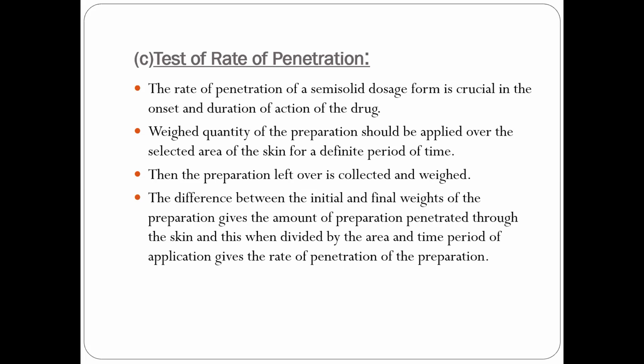In this case, the rate of penetration of a semi-solid dosage form is very crucial for the onset and even the duration of action of the drug. Here a weighed quantity of the preparation, that is the ointment, is applied to a selected area of the skin for a definite period of time. Then the preparation which is left over is collected and weighed.